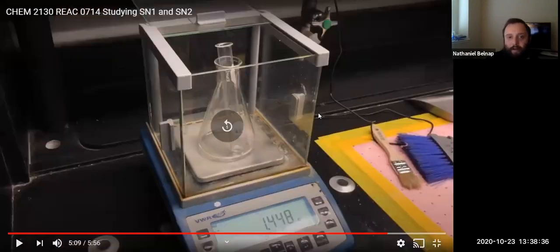Did you guys all see that? 1.448 for 1-bromobutane.